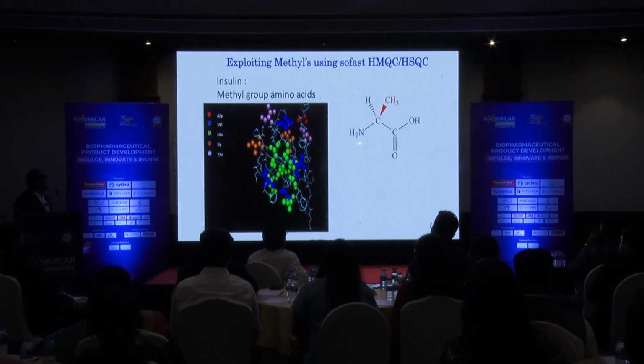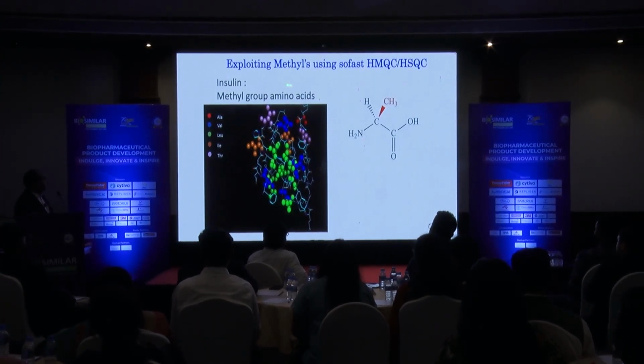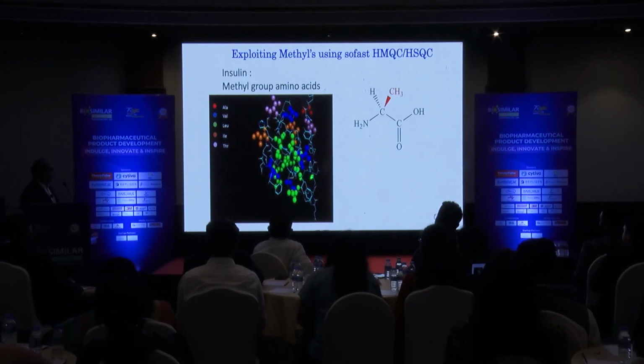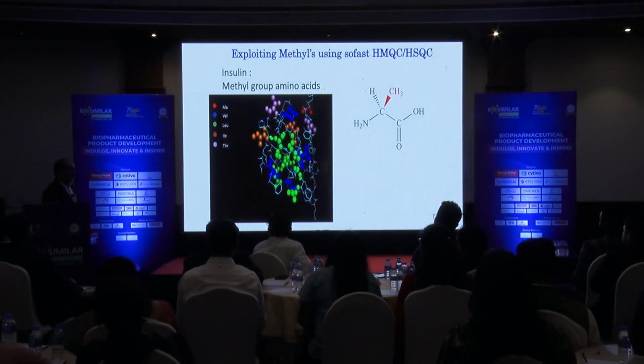So exploiting this, one can record a spectrum, and if you plot those methyl groups in the higher order structure of a peptide or protein, you see they are separate, they are spread over the whole protein sequence. So if we get a signal from these methyl groups, we can assess the whole structure of this protein or peptide.